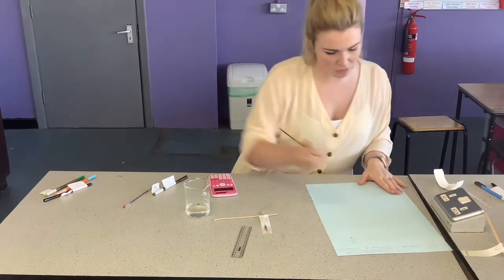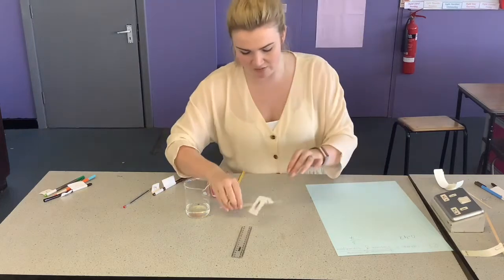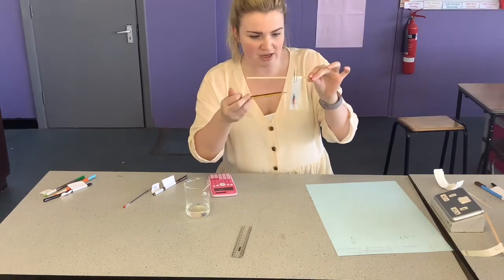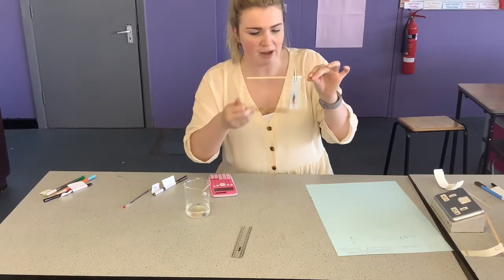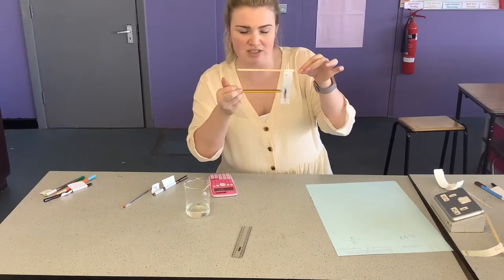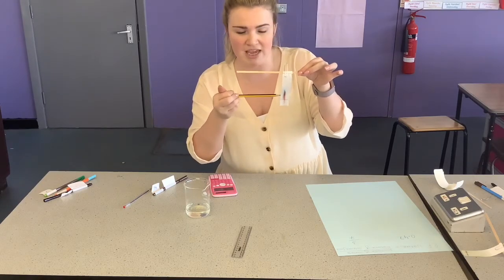That gives you 0.42, so that would be the RF value of this sample. The further the sample travels up, the larger the RF value, and the more soluble the substance is. A couple of inaccuracies: as you can see, this has got loads of different colours on here and it's really hard to pinpoint where it's stopped — so that's our major inaccuracy.